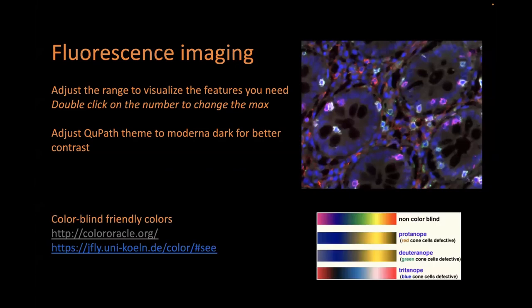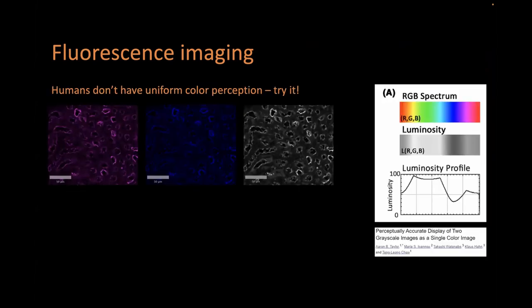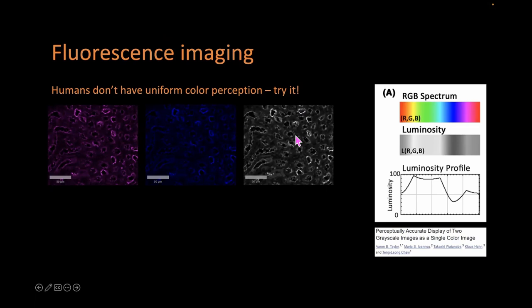Remember you can switch to a different viewer with the dark/modern black theme. Be colorblind-friendly — remember that humans do not have uniform color perception. Go to your viewer, select only a single channel like WGA, and change the color from magenta to blue to grayscale, and see for yourself that your color perception is actually different. The pixel values didn't change — we changed the lookup tables — yet your eyes perceive blue as much dimmer than magenta. Grayscale always looks the best, and that's why checklists suggest adding grayscale versions when exporting multi-panel images.